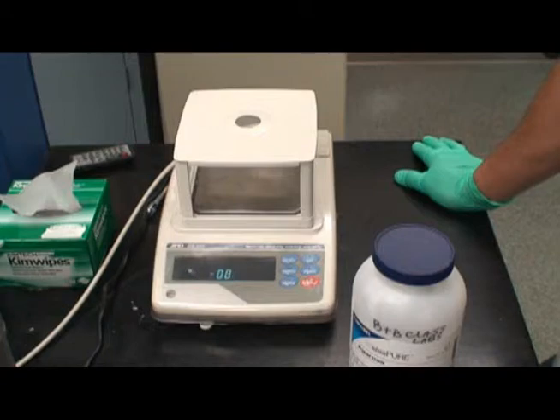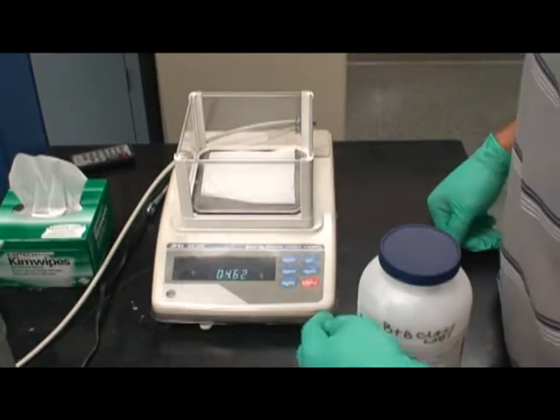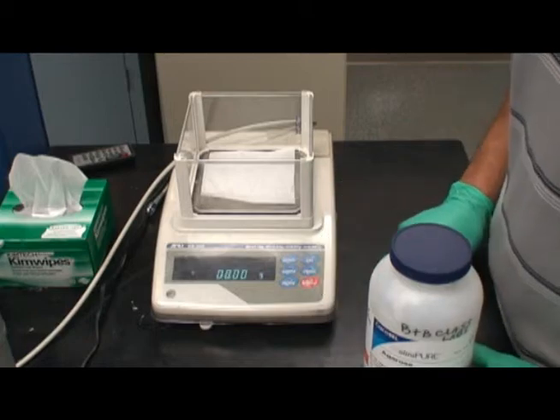Using the balance, measure out precisely 1 gram of agarose. Too much or too little agarose will result in poor gel electrophoresis. A creased kimwipe can be used as a plate for the agarose. Remember to zero the scale after placing the kimwipe on it.